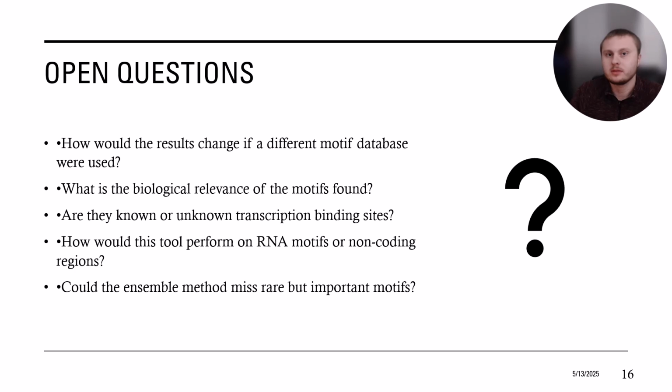So to wrap everything up, we want to look at some open questions. And the first one would be, how would the results change if a different database were used? So a different database might give different motifs, which could change our biological conclusions.